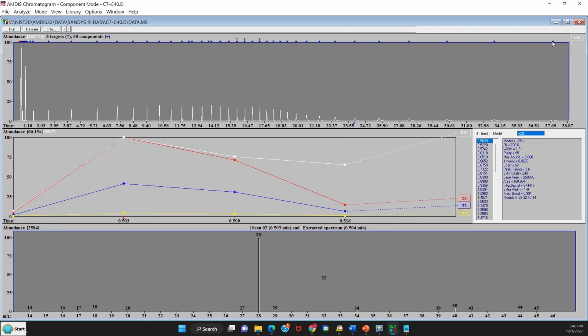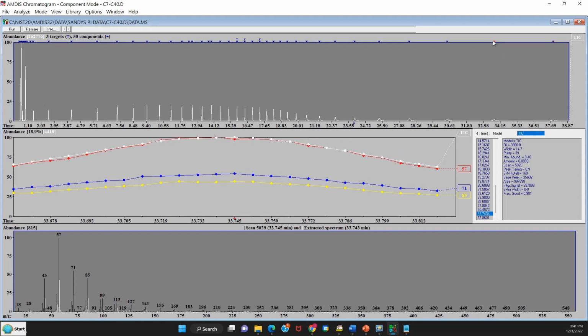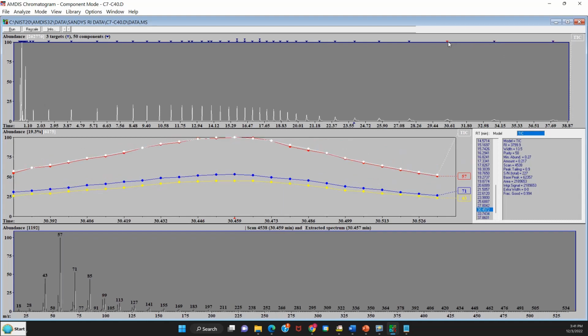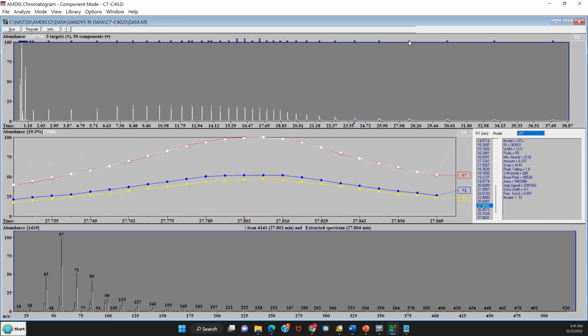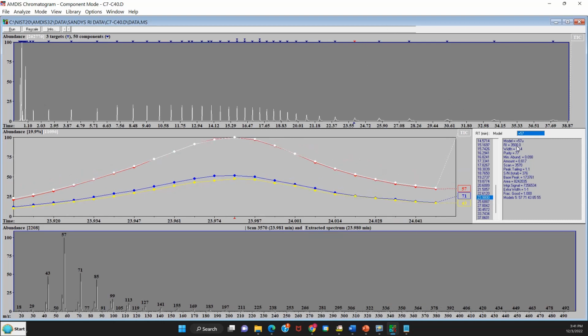We'll go out and click on the little down arrow up here at the top, all the way to the right at the top, and click on it and go down to the information box here, and it shows that the RI for that is 3,999.6, pretty close to 4,000, isn't it? And just check all four of those. That one's 3,900, that one's 3,800 essentially, that one's essentially 3,700, this one's essentially 3,600, and the last one should be dead on because it was done by the auto calibration, 3,500.